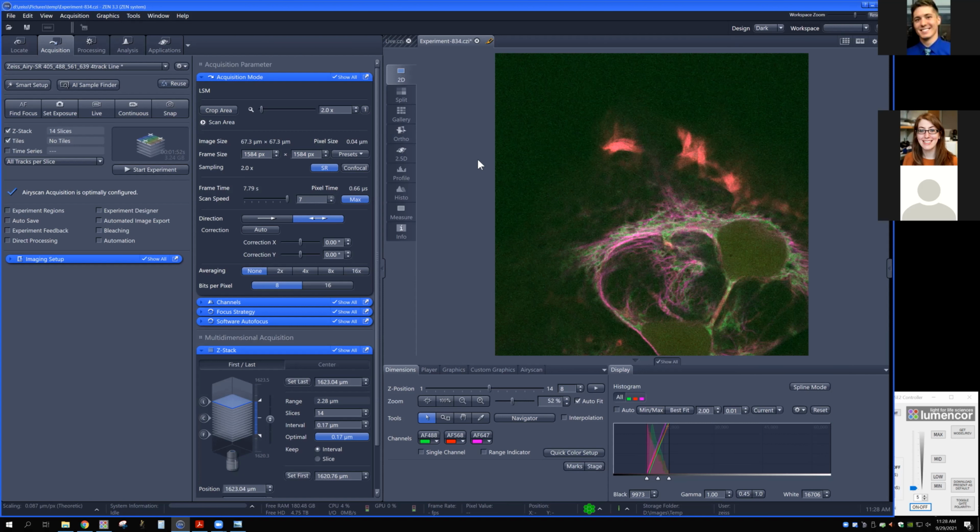But we had a lot of people using this across massive areas, and so that was one of the places where you could scale back. And by the time we do the processing, it's going to convert everything to a 16-bit grayscale anyway. So the amount of intensity information that the Airyscan carries across all of these different detector elements, even at 8-bit, gives you pretty phenomenal signal to noise.